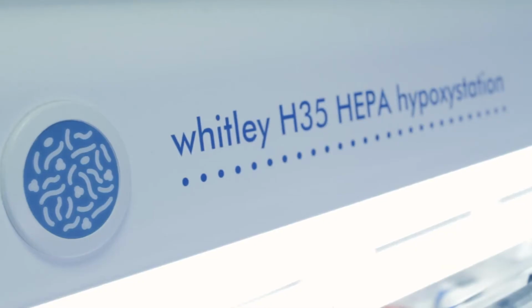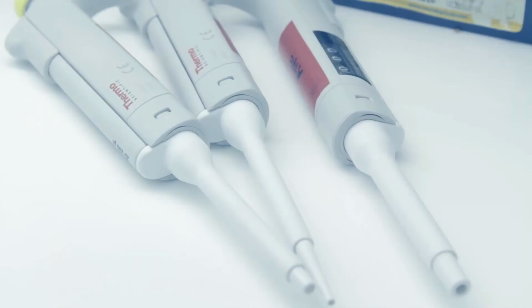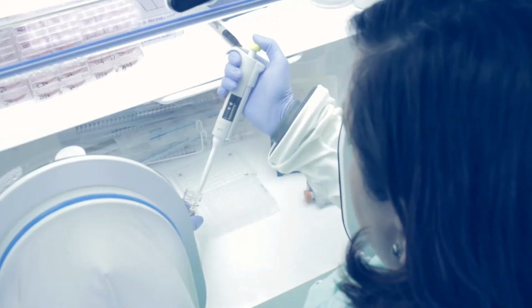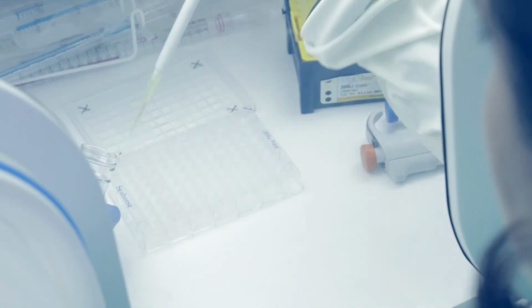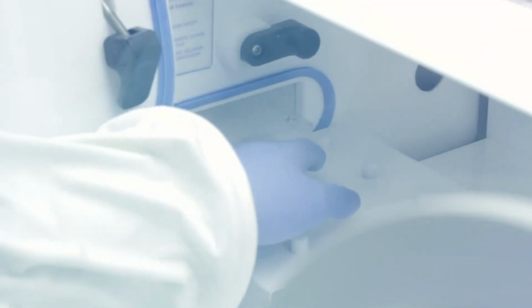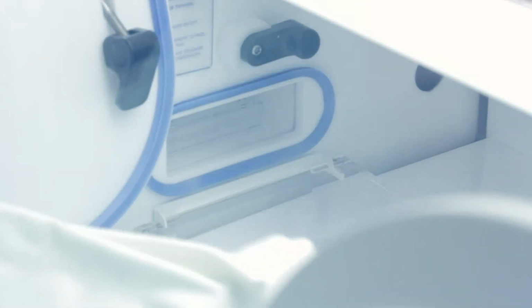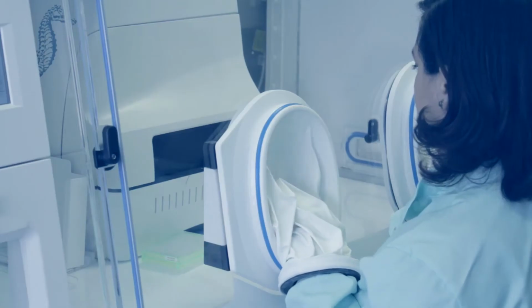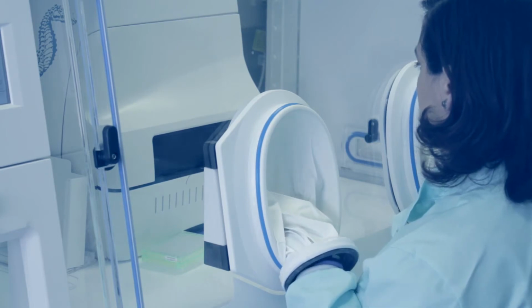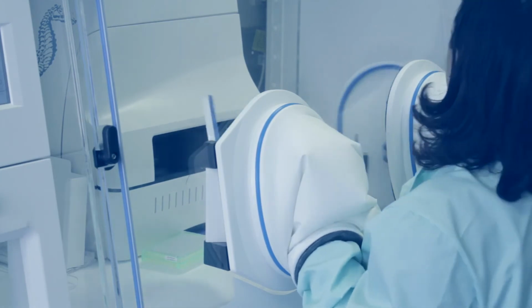We first seed our cells on plates and then incubate these cells overnight for 24 hours or for the duration of the experiment of the treatment that we are interested in. So the next day the samples are transferred through the transfer tunnel into the I2 chamber. This chamber does provide us the environment that we need to do our analysis by using the Seahorse XF analyzer. The unique thing about I2 is that it has no CO2 in it and it has slightly reduced temperature so that the Seahorse analyzer can function.